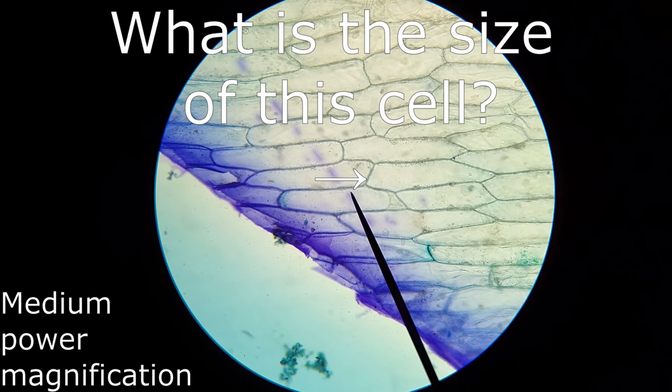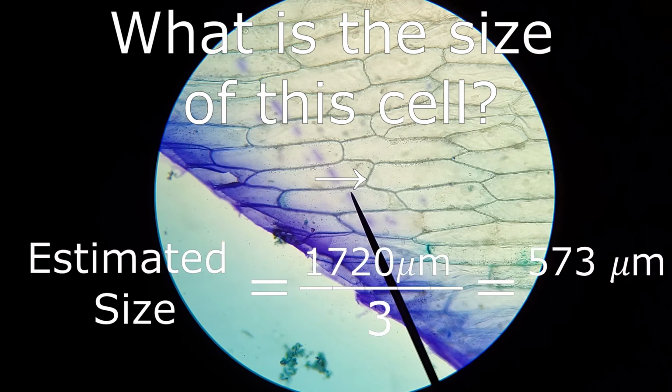When I look at the cell in the picture, I estimate that 3 of these cells could fit side by side in our field of view, or our field diameter. So when we go to estimate our size, we take our field diameter, which is 1,720 micrometers, divide it by our fit number, how many could fit side by side, which is 3, and we get approximately 573 micrometers. That means that this onion cell is approximately 573 micrometers long.